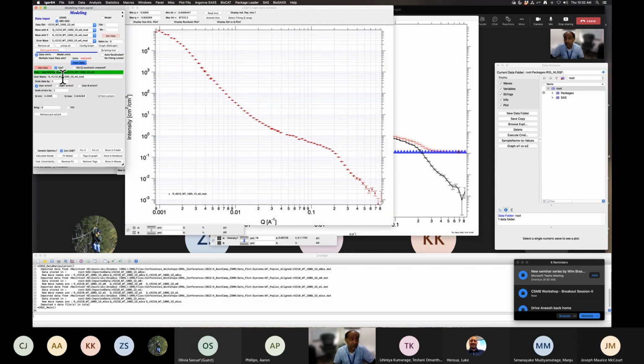Then, once you have done that, the next thing is to select the data controls, add data. So the data which is over here gets saved under data controls. And here we are only using one. We're not doing multiple data sets. We could actually fit multiple data sets also if required, but there are some constraints you need to keep in mind.